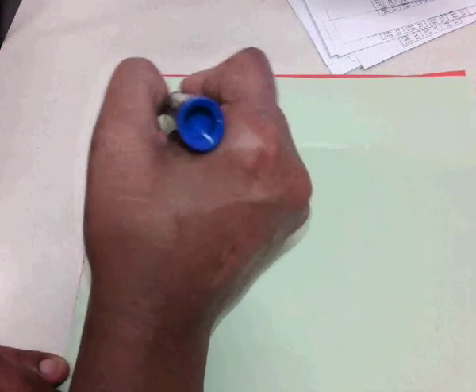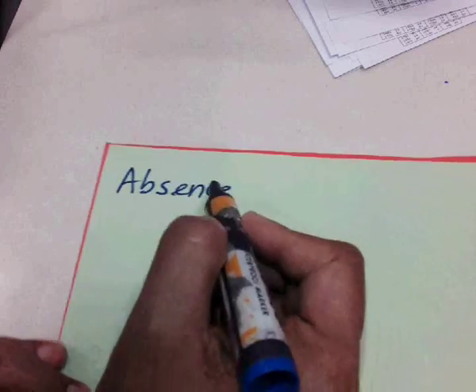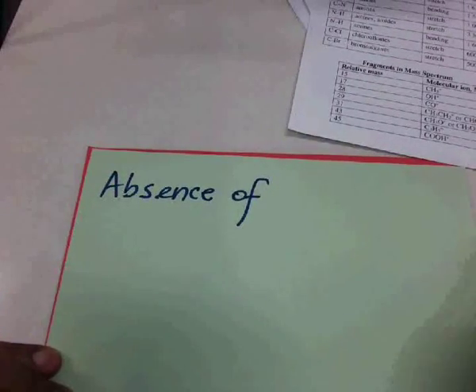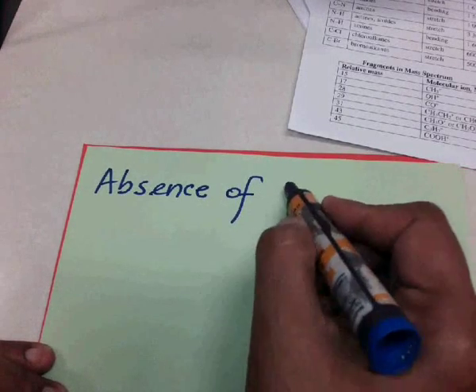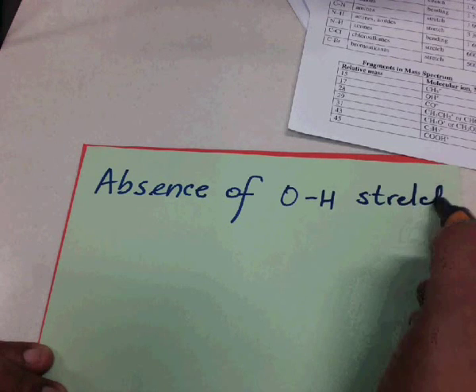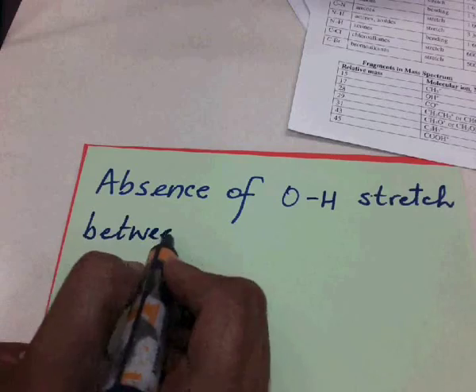the absence of an OH stretch between, so I'm just using the words that they provide on the data sheet.